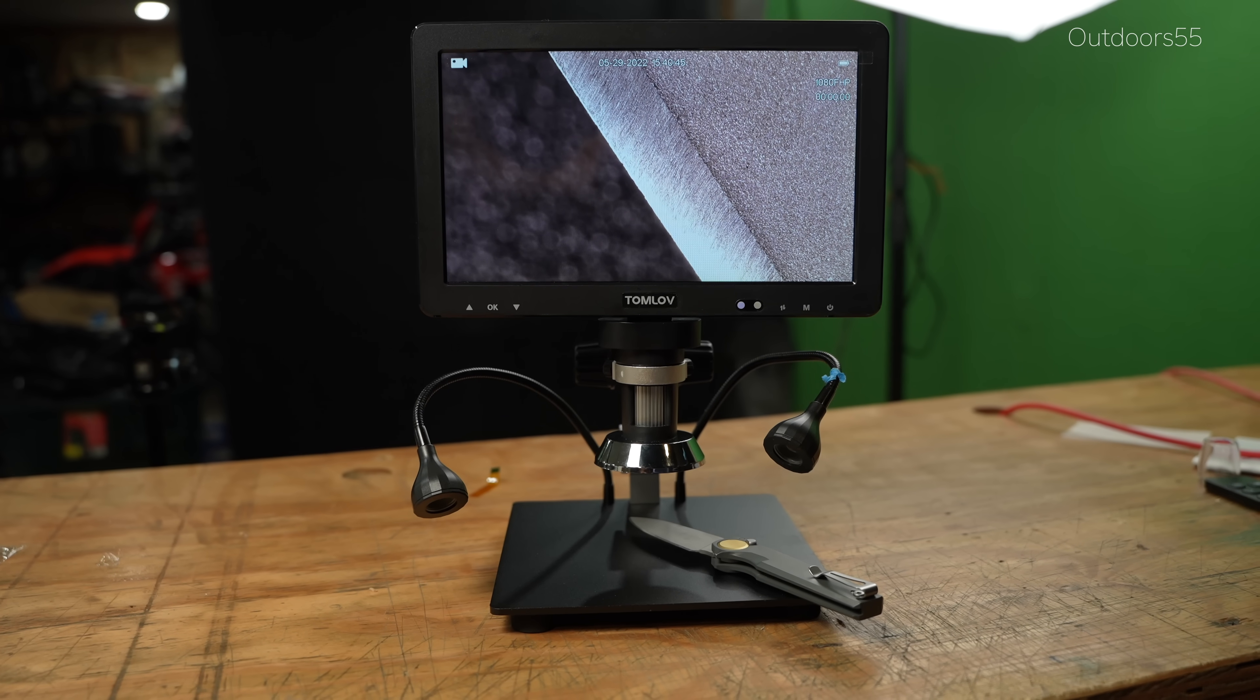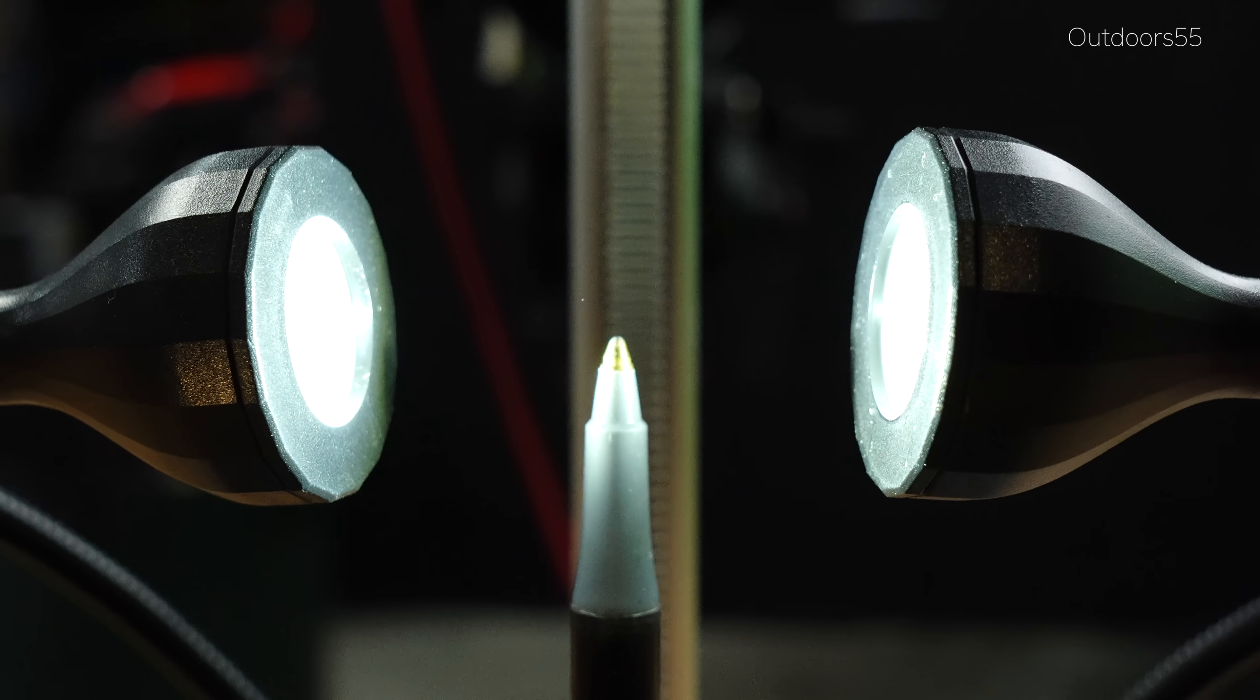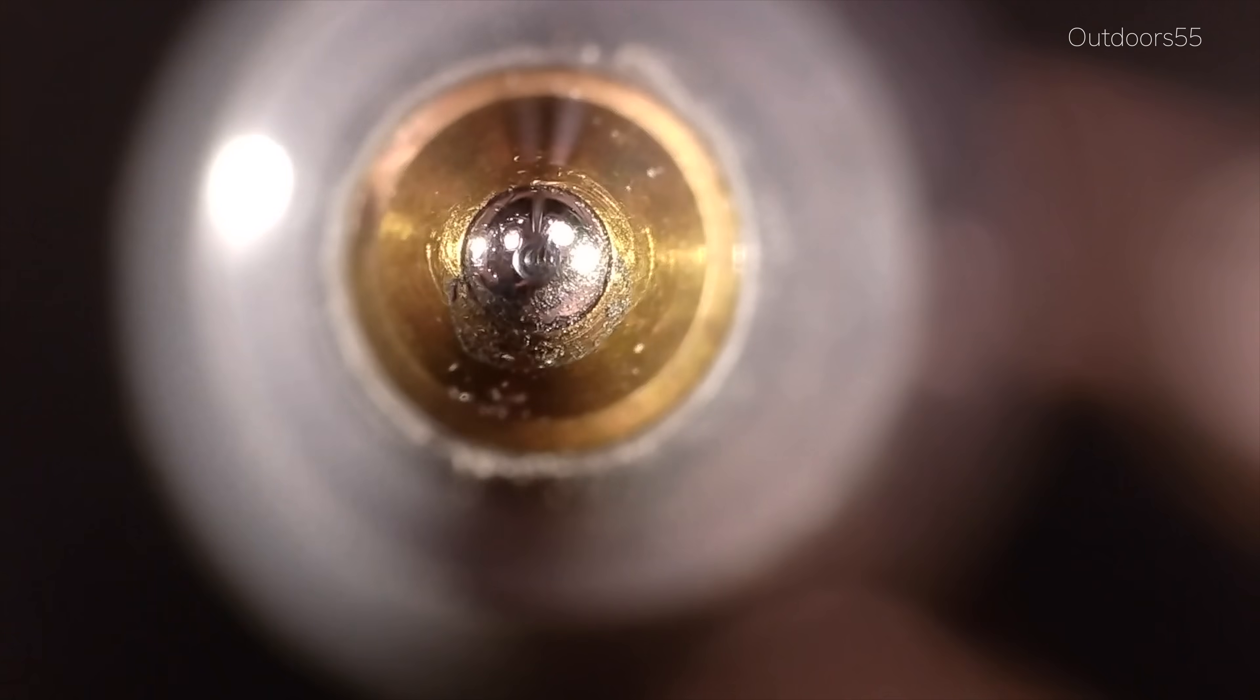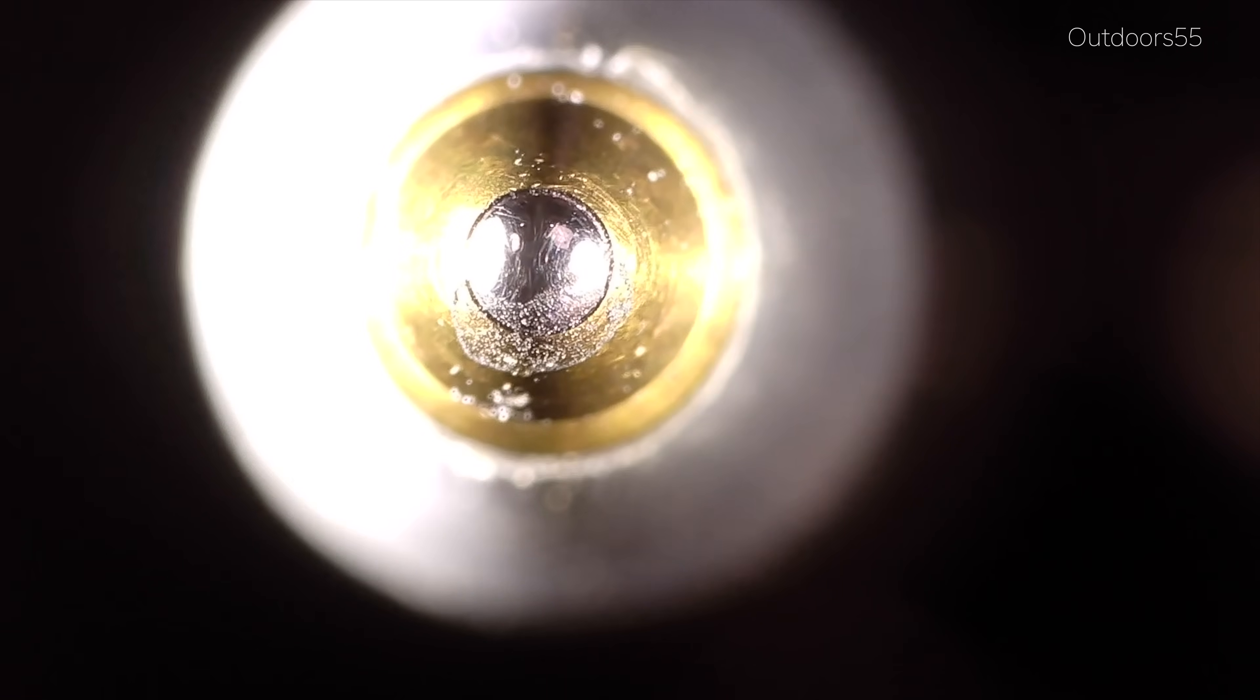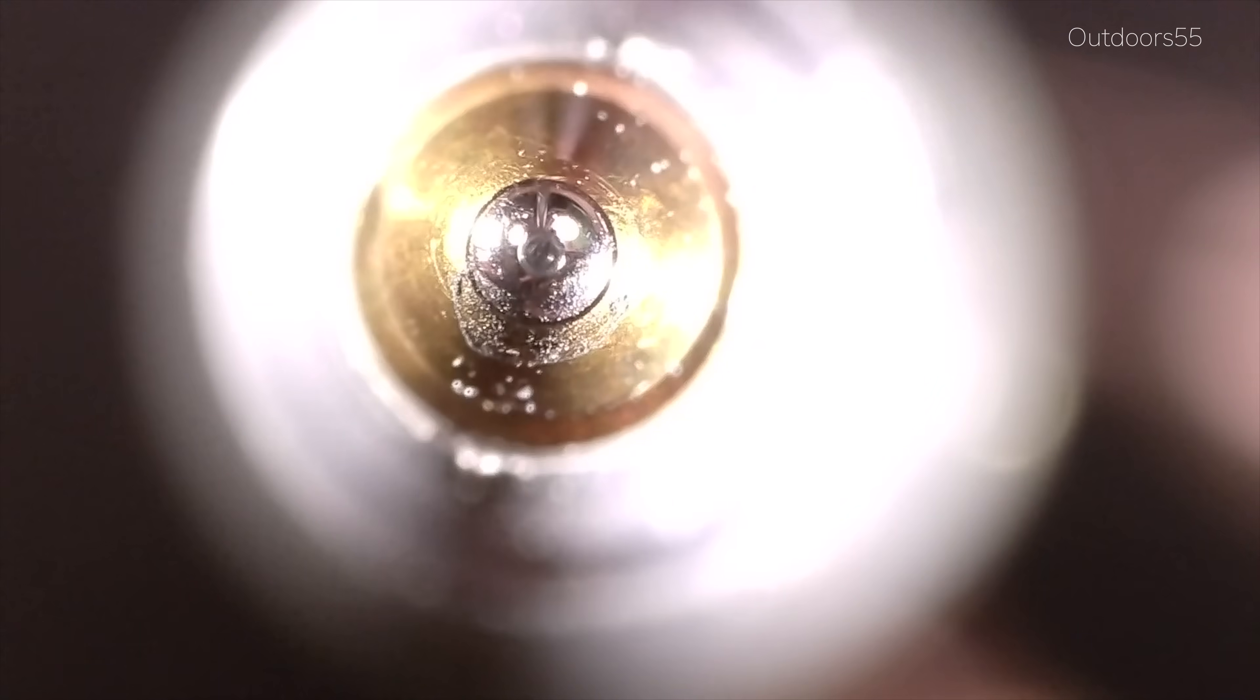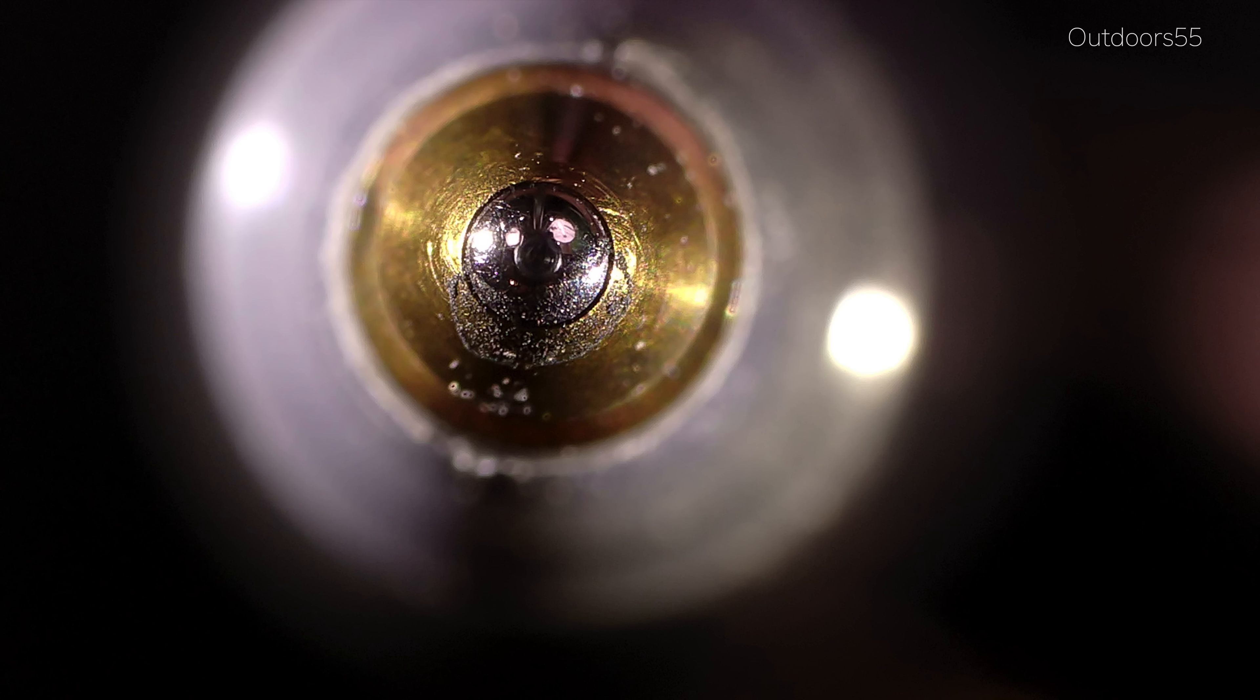So one big downside to these cheap microscopes is actually the lighting. We typically don't want super bright LED lighting creating all kinds of reflections on the object we're viewing. These reflections give us very bright spots in some areas and very dark spots in others, and if we adjust for these bright spots, we end up making the entire image too dark. Now because this is a digital microscope, essentially a camera projecting the image onto a screen, we run into something called dynamic range.